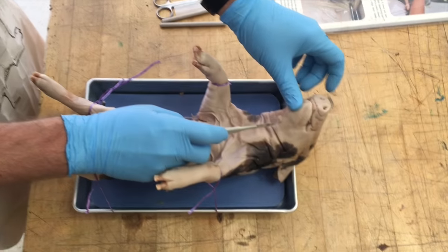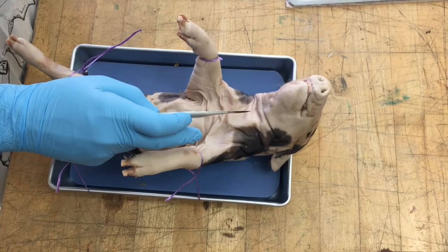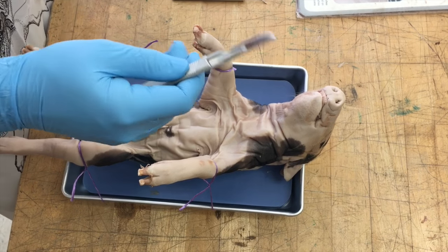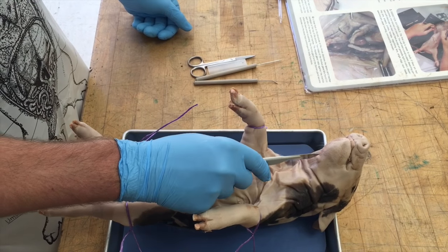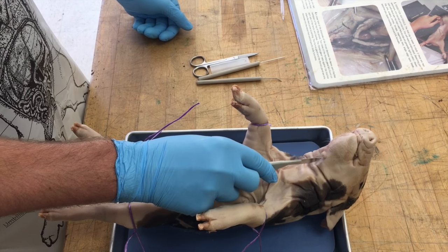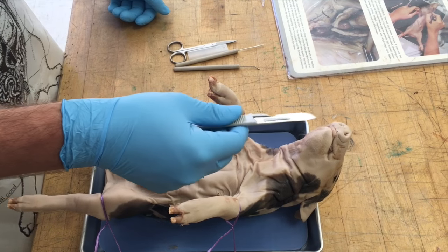Our third step is to begin making our first incisions into the pig. The first thing you need to do is make sure your scalpel is not going to cut you. Always cut away from you — especially if your partner has their hands on the pig — and make sure your fingers are nowhere near where that scalpel can cut, because it is very sharp.